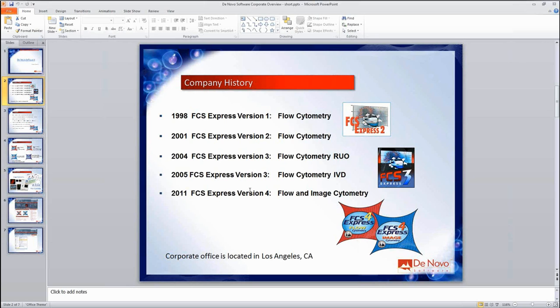The really nice thing about that is we can link directly back to the images as well. So if we have a dot plot showing fluorescence 1 versus fluorescence 2, we can identify subpopulations and link them back to the actual image of that cell. And in the last year, we've worked with the imaging side, the Life Technologies Tali team, to provide direct compatibility with that data.